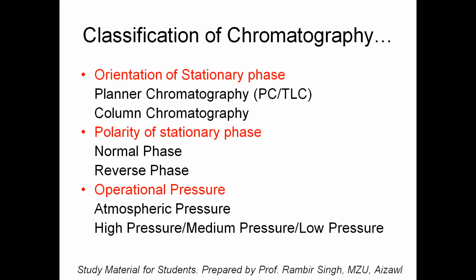We have certain solid stationary phases which are not even soluble in water. Note down that the most common solid stationary phase used today in chromatography is silica gel. You might have heard about it. If not, write it down: silica. Silica is obtained from diatomaceous earth, and it is largely used as a solid stationary phase nowadays. It is polar in nature.